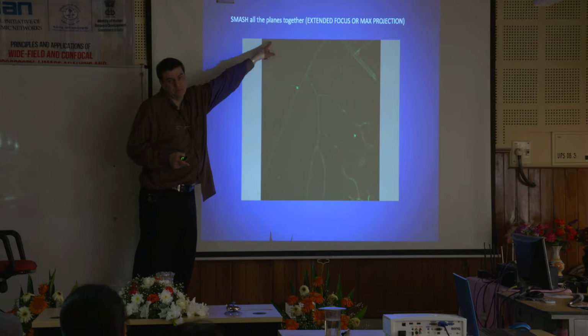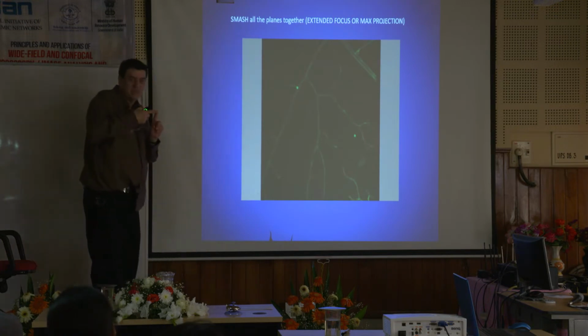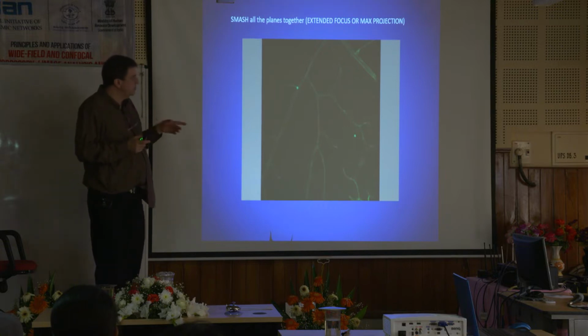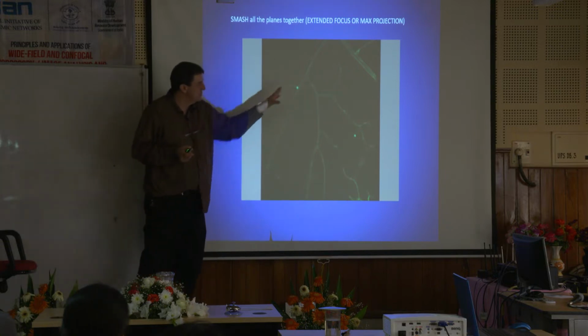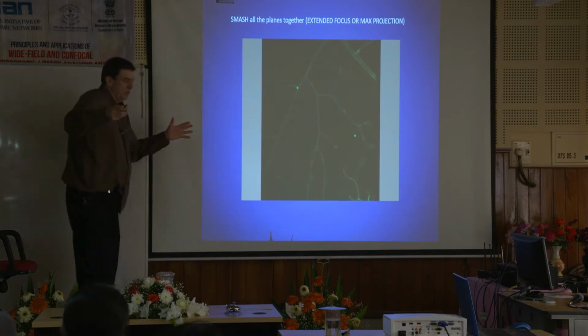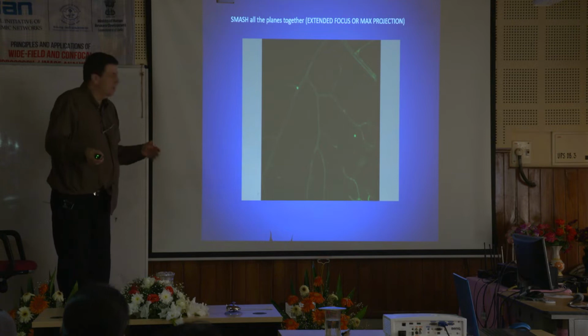It goes to pixel number 2. It does the same thing. Which pixel number 2 in all the deck of cards is the brightest? So by doing that on every single pixel, you get a one card view of what the image representation is.